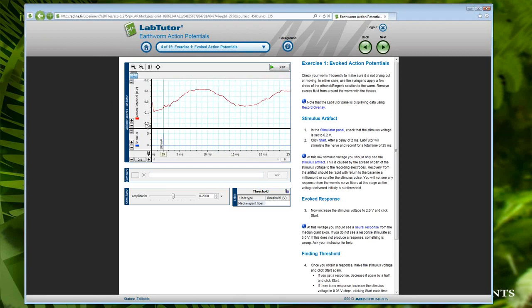and you'll see that I'm in an exceptionally noisy environment here in our classroom in Colorado Springs. So I've got this terrible 60 cycle interference here, and this is a relatively common problem. Fortunately, this prep is usually robust enough that we can still get usable signal even with this electrical noise. If I had the facilities here to do a little more grounding and a little more shielding, we could clean this up significantly. So I'm going to go ahead and be a bad student, and we're going to jump ahead instead of going through incrementally here.